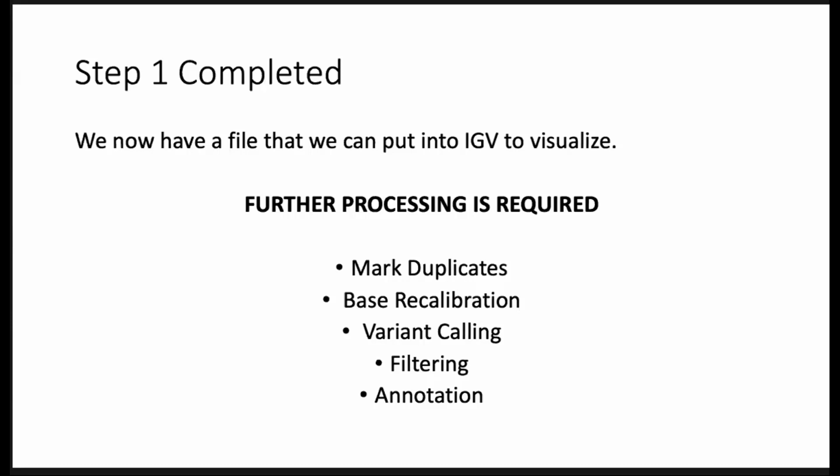Once the processing is done, we can use the mutation information and cross-reference online databases such as cBioPortal and other large online data sets and databases for cancer, for example, to see if there are any important trends associated with that mutation. Now I will let Robin elaborate on how to properly use online databases. Keep in mind there's going to be a cancer focus, but this can be extrapolated to other online databases that are available as well.